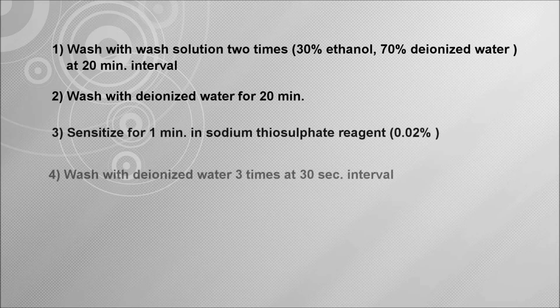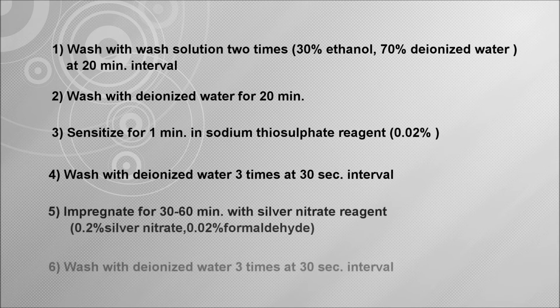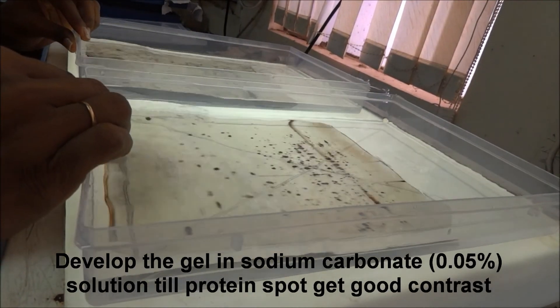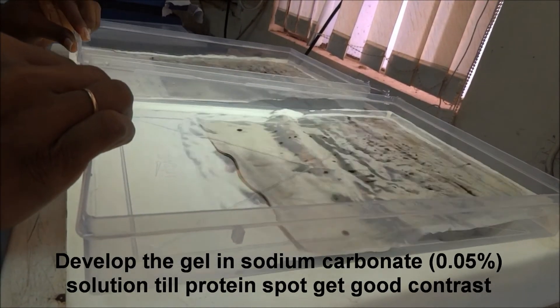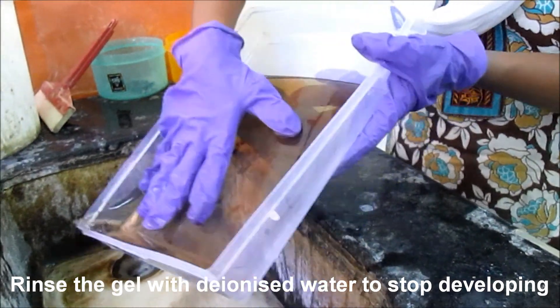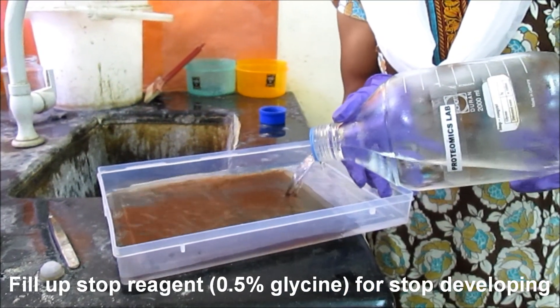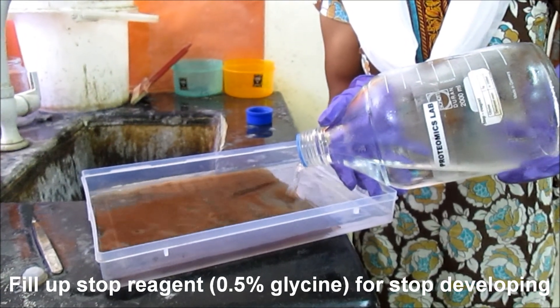Fourth, wash with deionized water 3 times at 30-second intervals. Fifth, impregnate for 30 to 60 minutes with silver nitrate reagent. Silver nitrate reagent contains 0.2% silver nitrate and 0.02% formaldehyde. Sixth, wash with deionized water 3 times at 30-second intervals. Develop the gel in sodium carbonate solution until protein spots get good contrast. Rinse the gel with deionized water to stop developing, then fill with stop reagent containing 0.5% glycine.